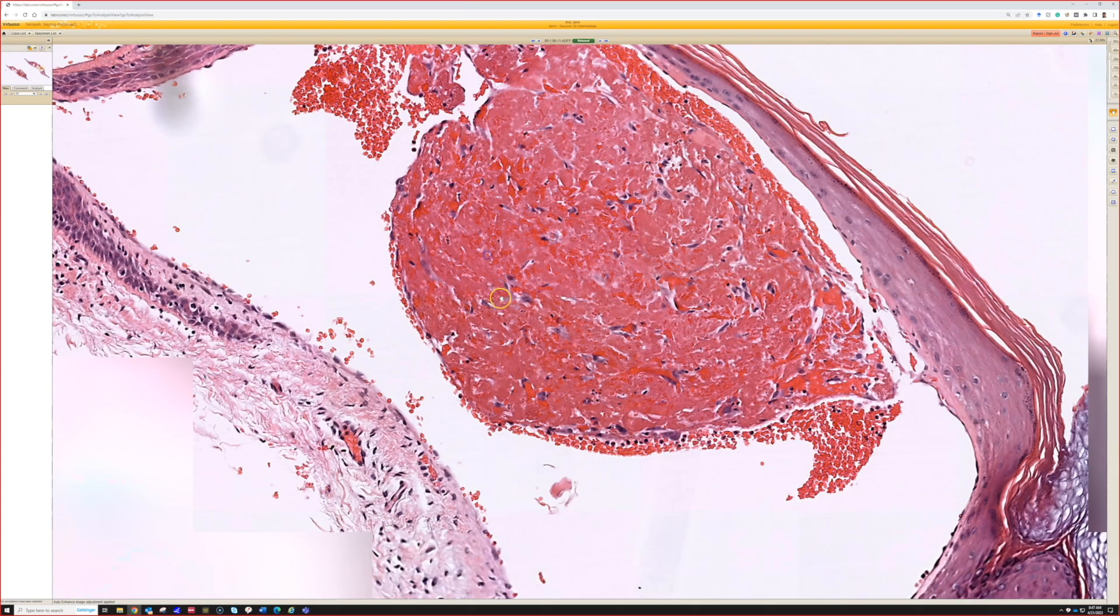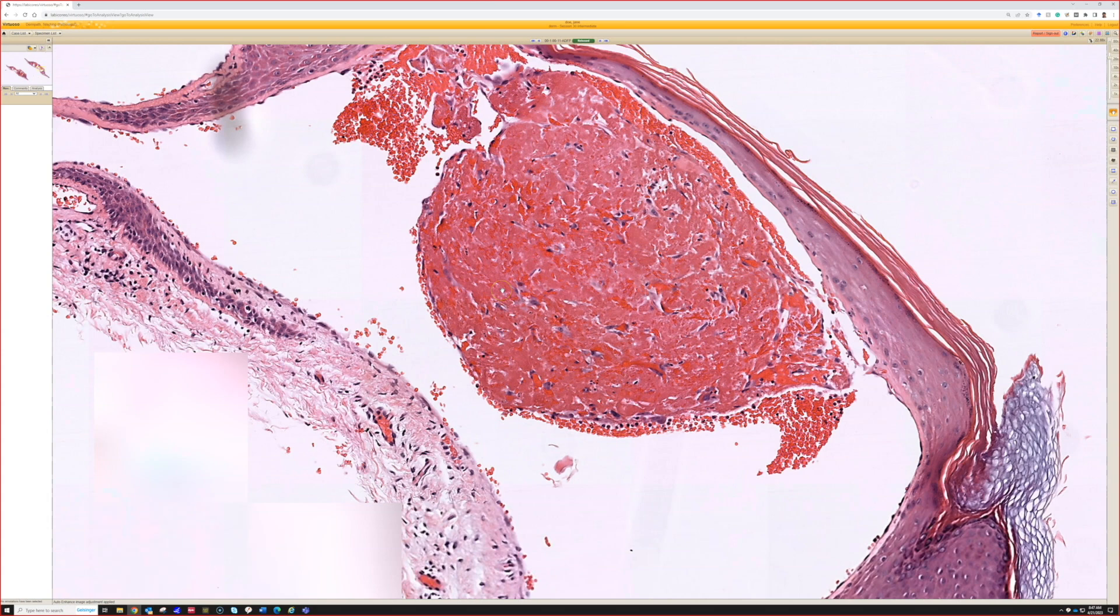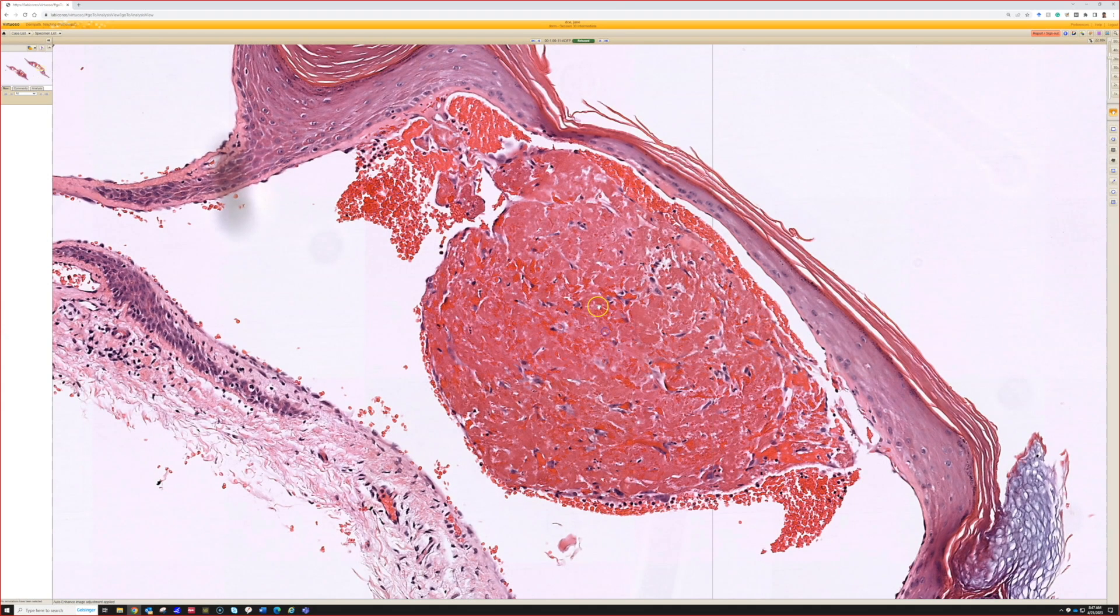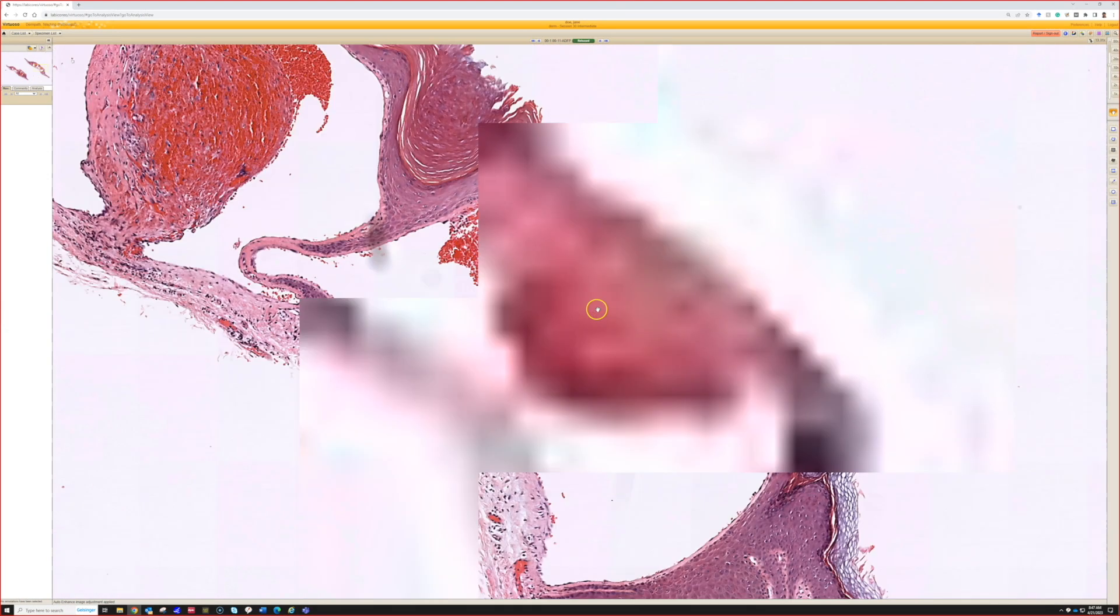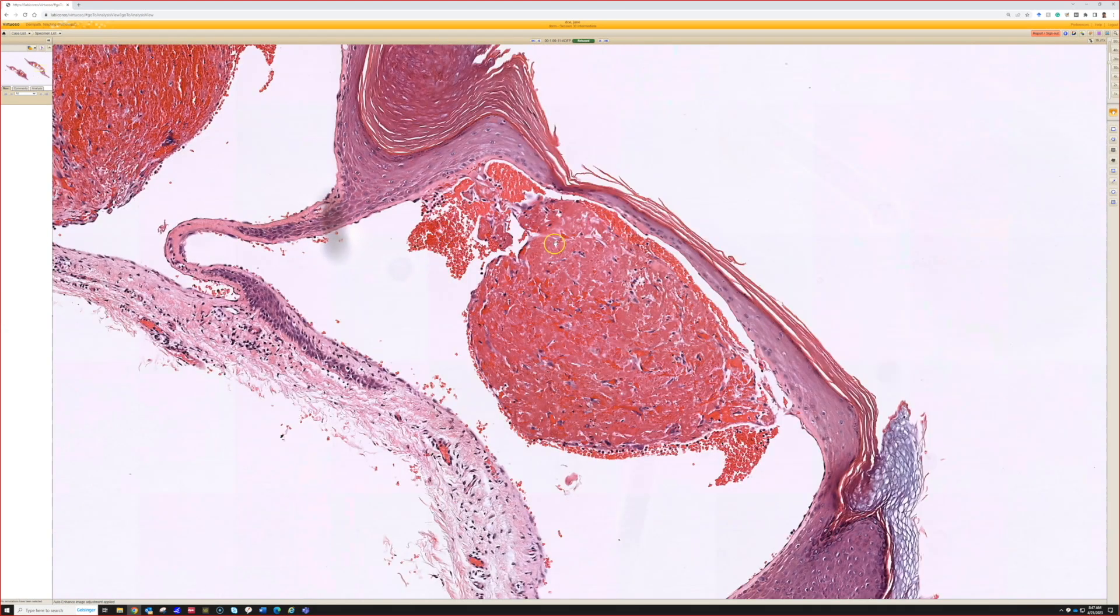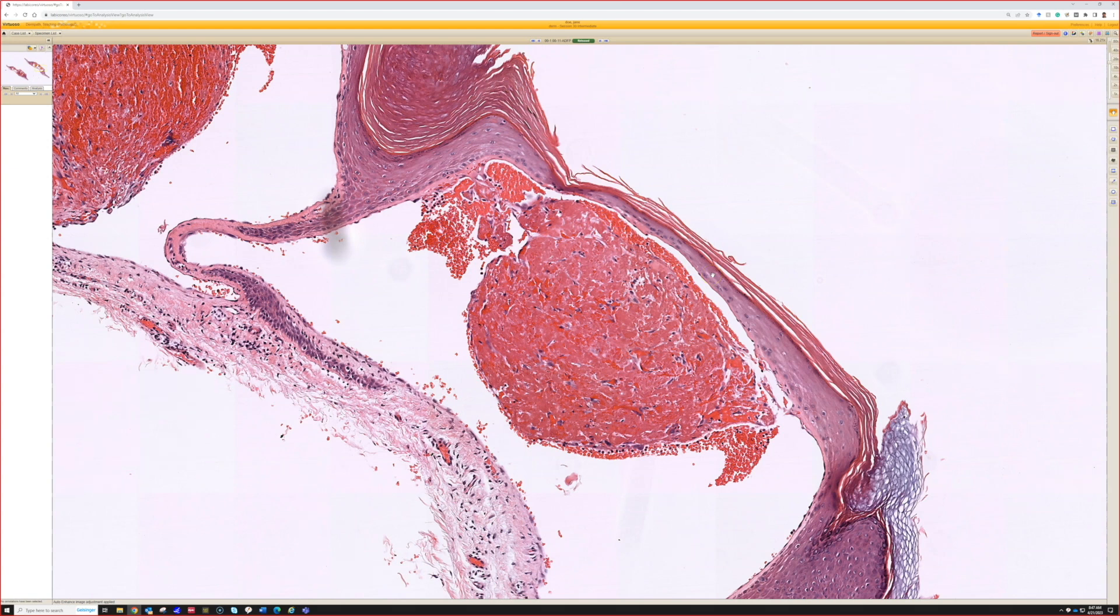So here I would call this angiokeratoma with focal organizing thrombus. These also oftentimes break open on the skin and bleed to the surface. They often, I feel, get traumatized and have hemorrhage and ulceration on top. Totally normal.